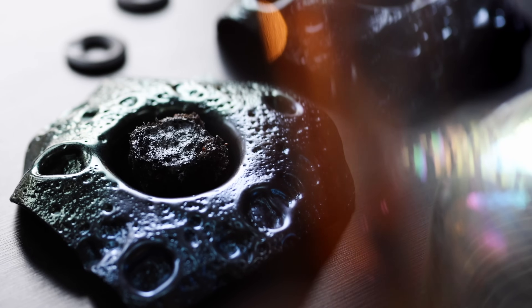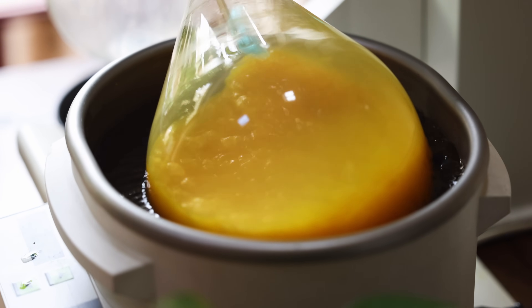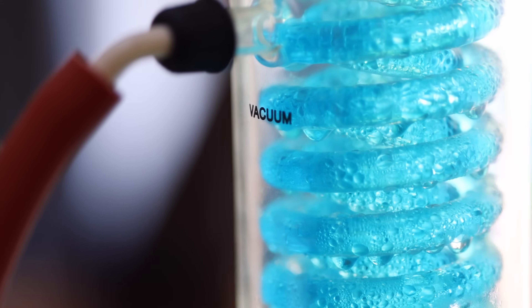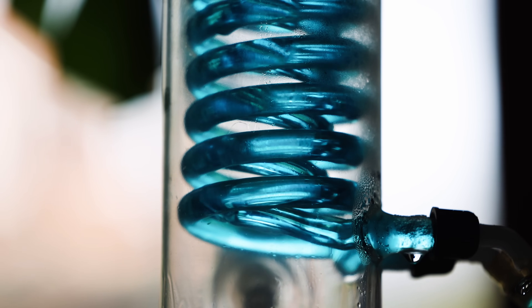Let's start with a quick look at the equipment itself and how it works. The Rotavap is basically a glass distilling still, and just like a copper still, liquid is evaporated on one side and that travels as vapor over to the other side of the still, where it's condensed and then collected.